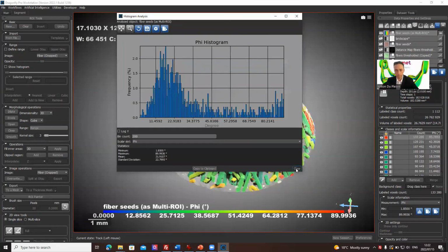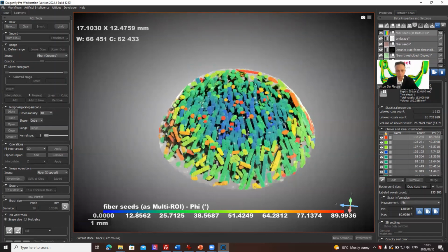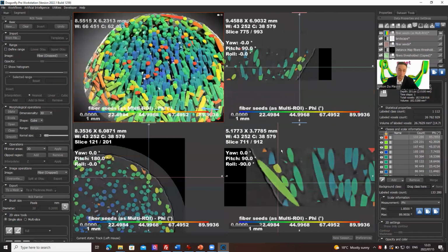and so on. Okay, so I think that's almost everything I wanted to do here. It's quite a nice demonstration, so I think I'm going to stop at that point and leave histographic segmentation for a next session. All right.